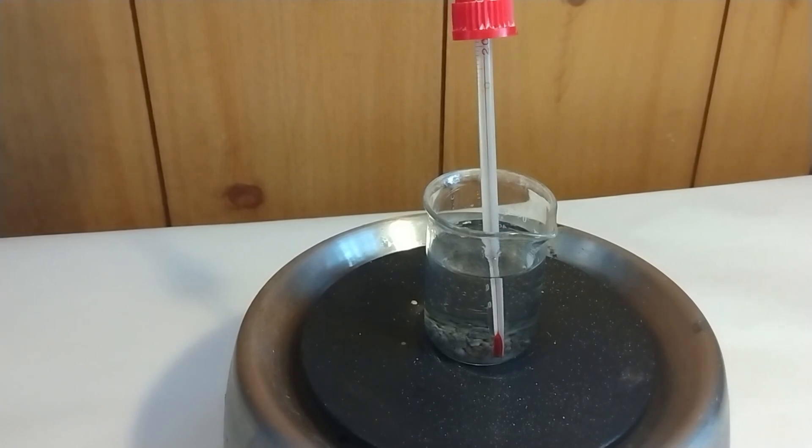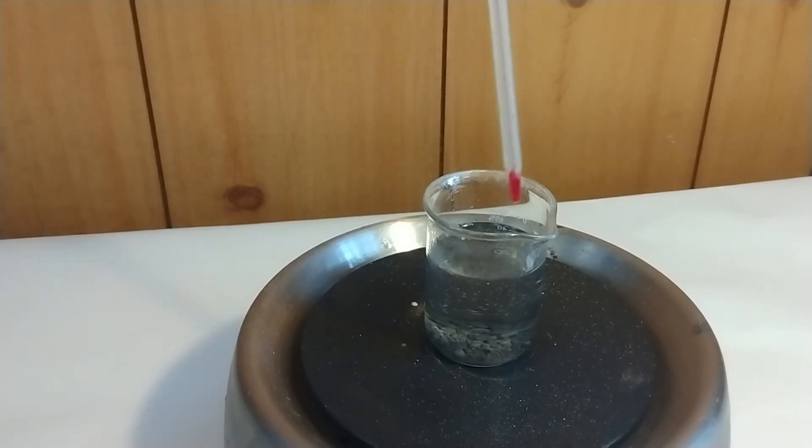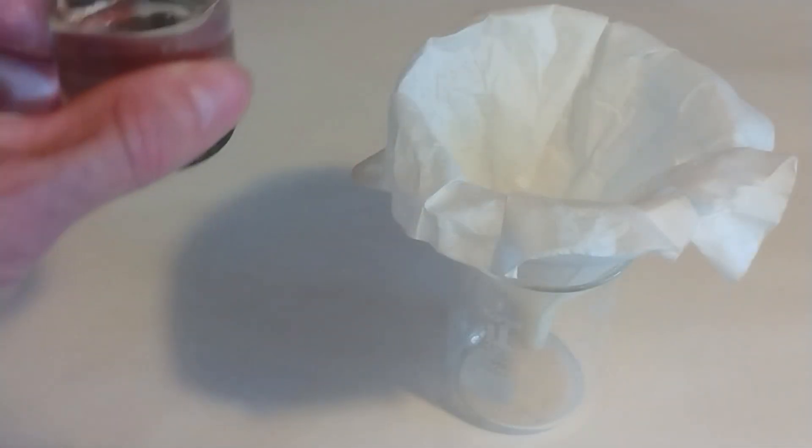The reaction is now complete. There's a lot of residue, but it's very spongy. The residue should be only antimony, so let us filter out the antimony.